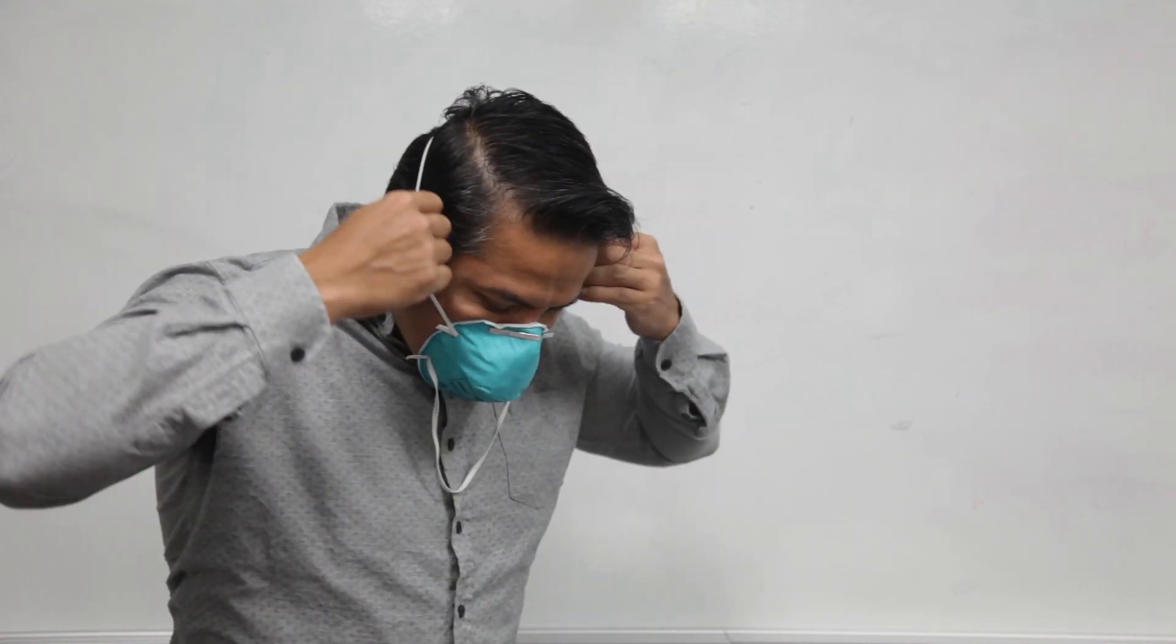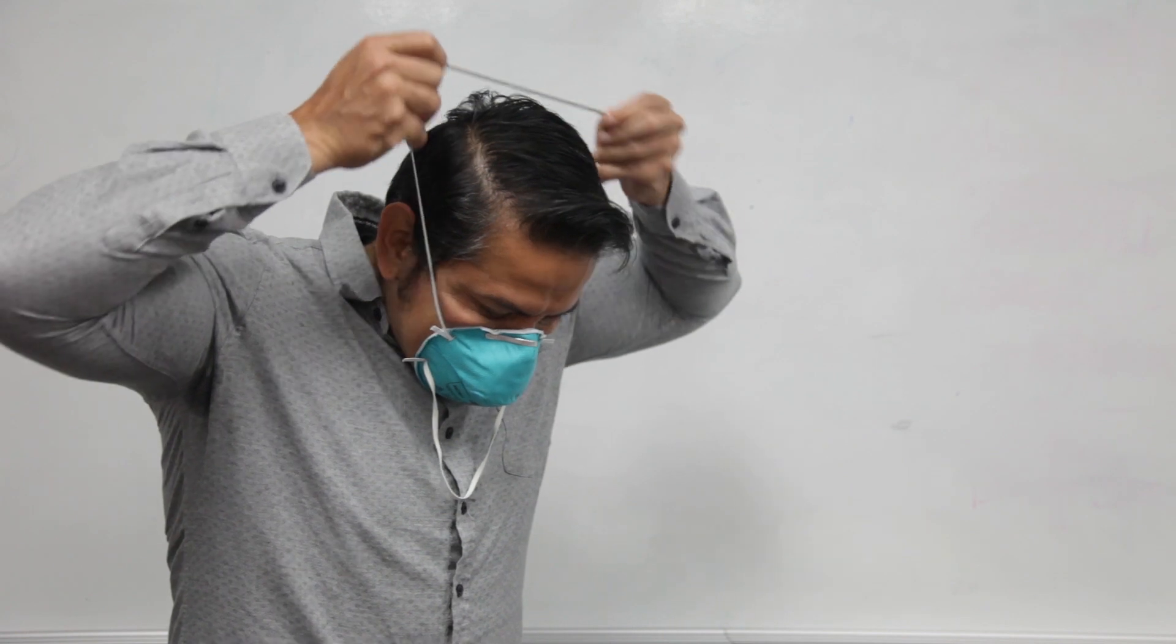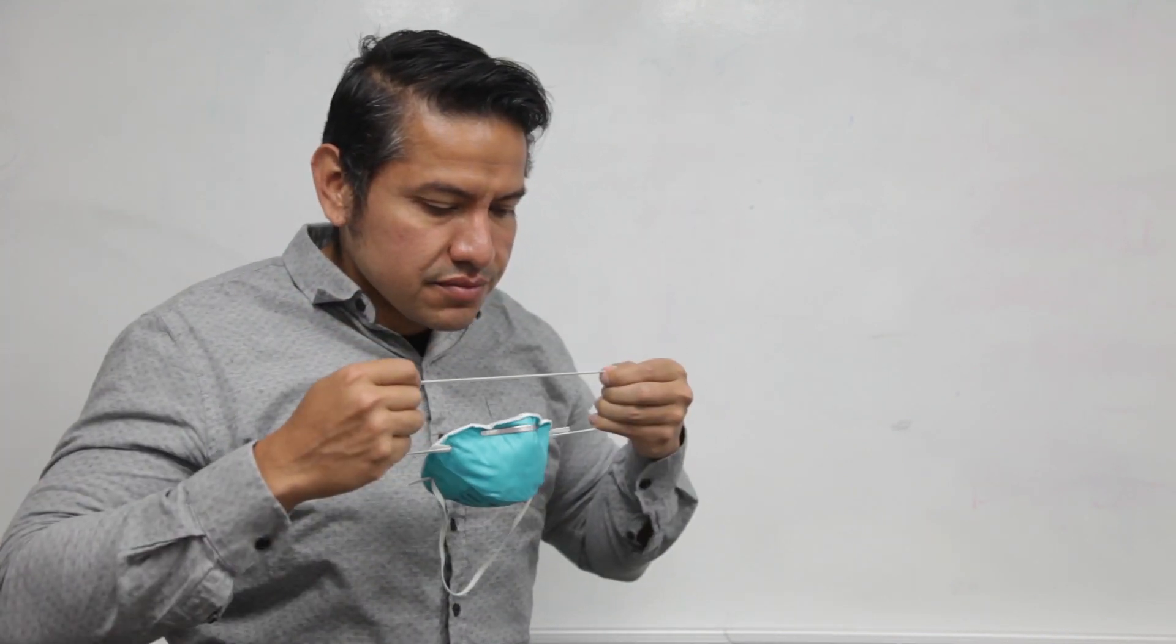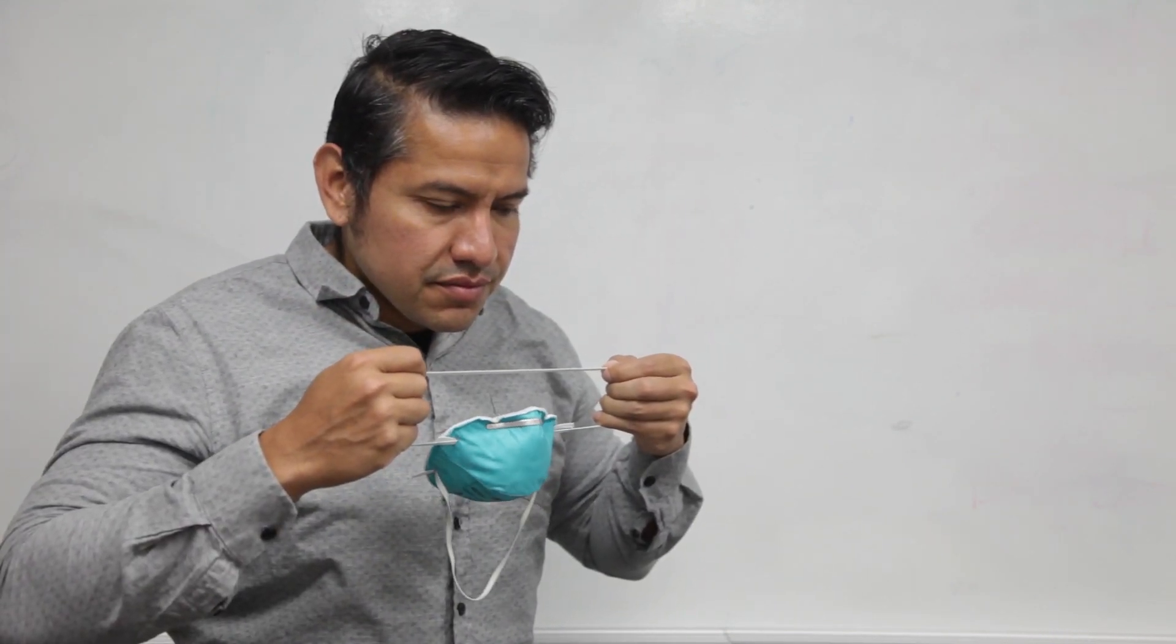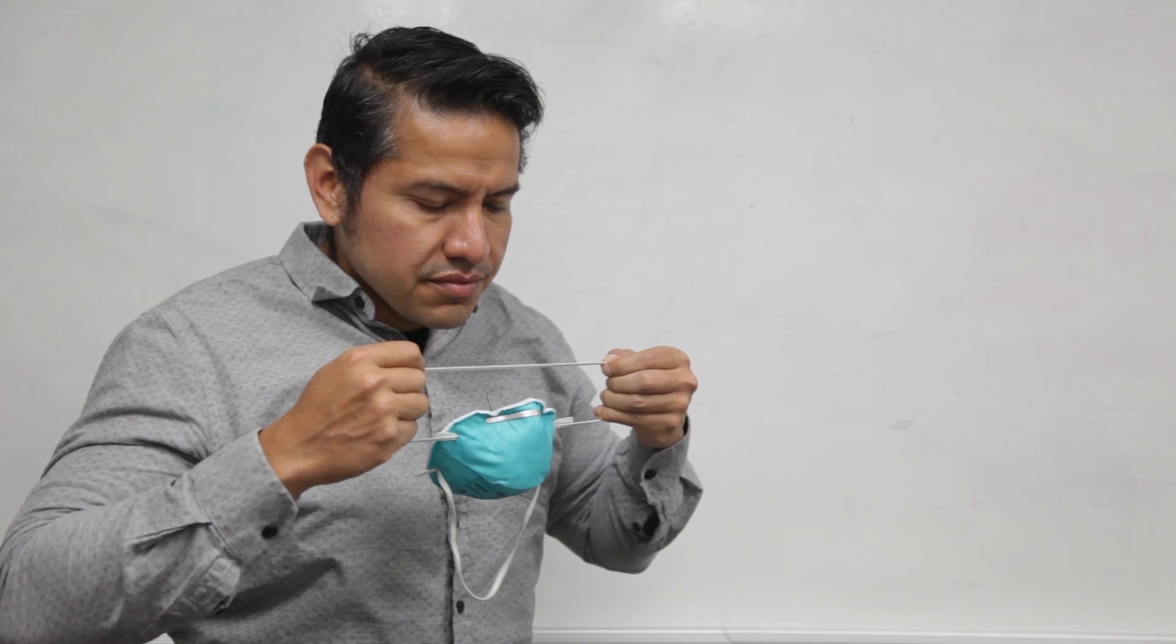Next, use both hands to grab the upper strap. Pull to the sides, then over your head. Keep tension on the upper strap as you remove it, which will let the mask fall forward.